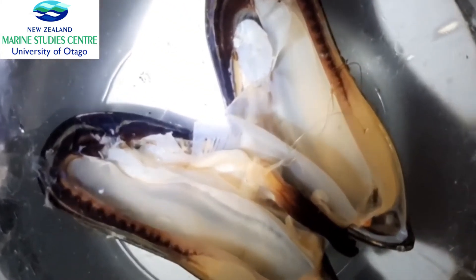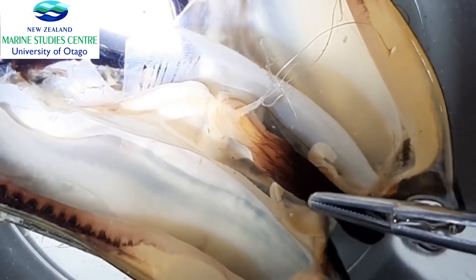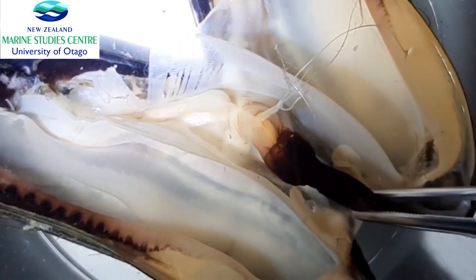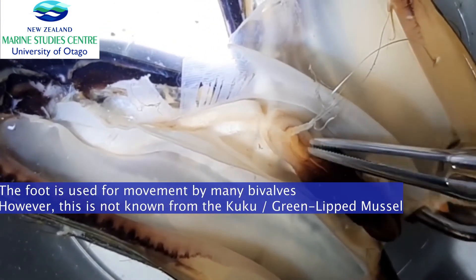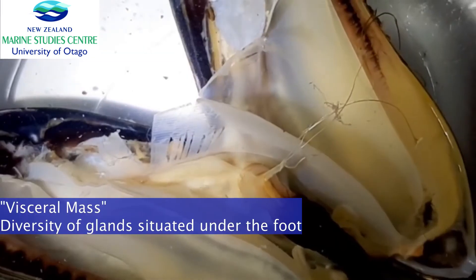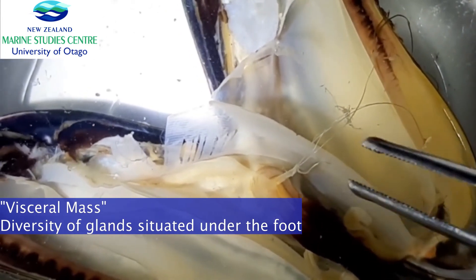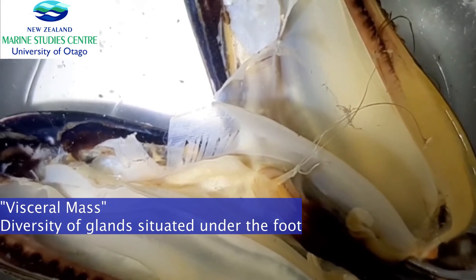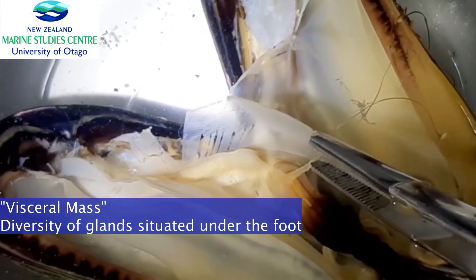Now let's take a closer look at the foot. The foot itself is very interesting. As shown with the small black mussels, it can be used to move around, and it also has glands attached to it which secrete the byssus thread — you can see them right here. There is also the visceral mass attached to the foot, which contains many different glands and compartments for digestion, intestine, reproduction, and the byssus threads.